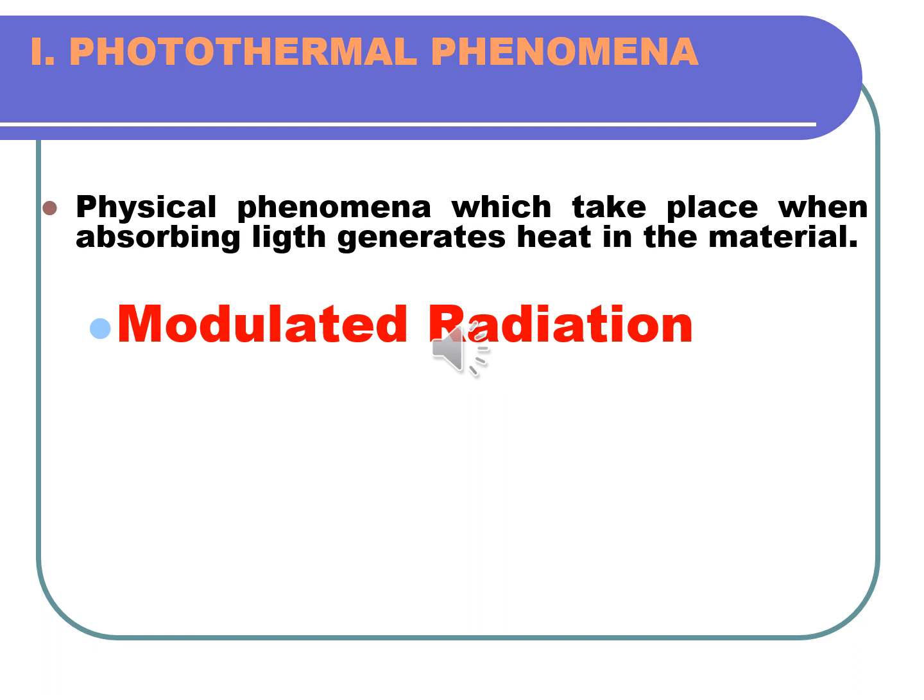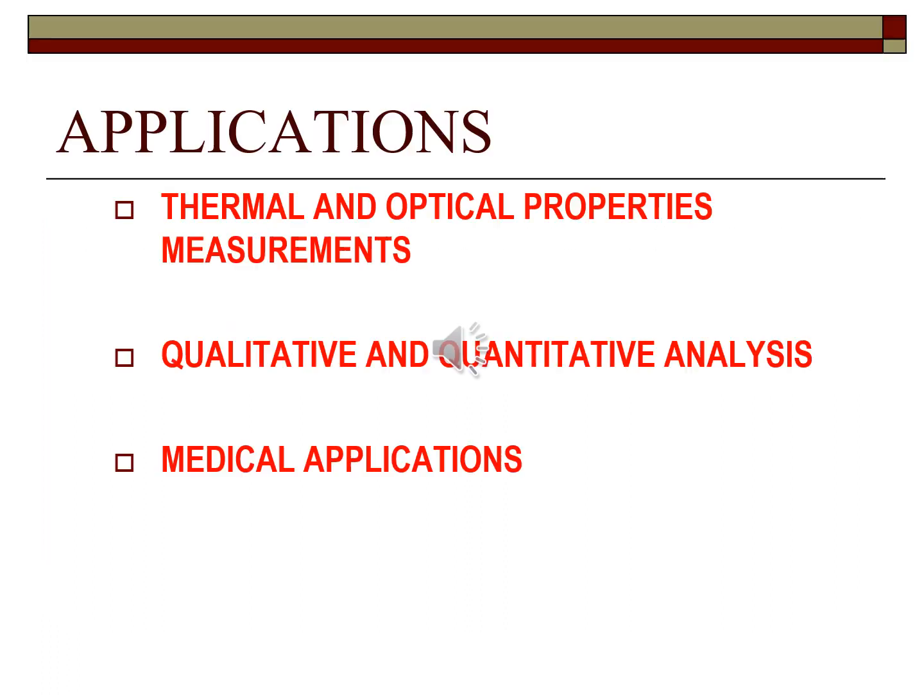In the first place, let me give you a brief explanation about this technique. Photoacoustic spectroscopy is based on photothermal phenomena. These are physical phenomena which take place due to heat generation after absorption of modulated radiation. There are a lot of applications of photothermal techniques. They can be used for thermal and optical characterization, for qualitative and quantitative analysis, and medical applications, among others.